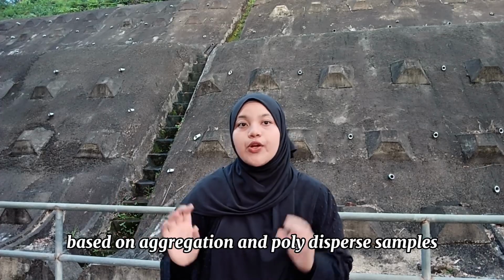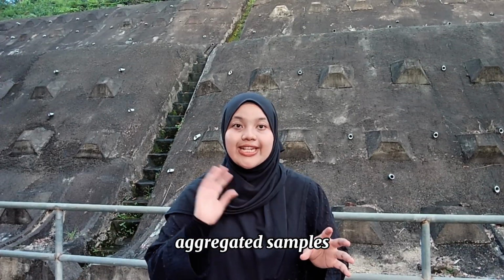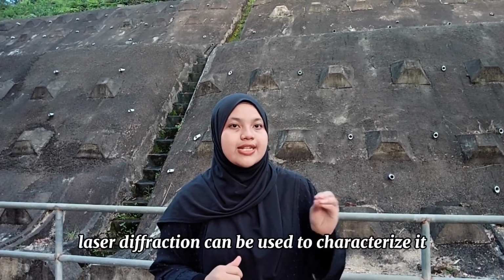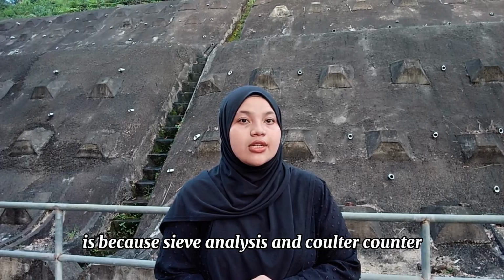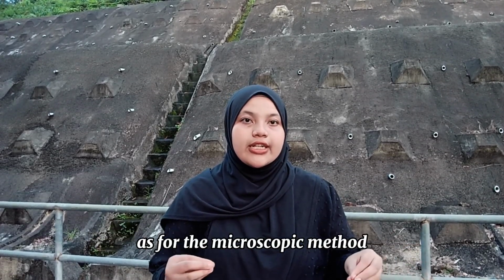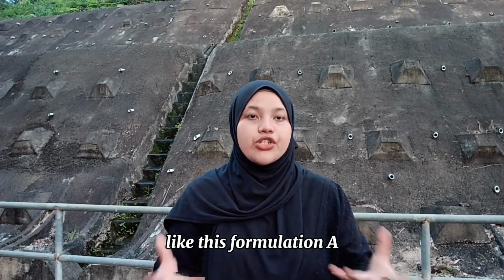Based on aggregation and polydispersed samples, it can be observed that laser diffraction could not characterize aggregated samples because it will not reflect the internal structure. As for polydispersed samples, laser diffraction can be used to characterize them. The reason we are not choosing the other three methods is because for sieve analysis and Coulter counter, the mechanism involved in both methods will actually damage the fragile proteins. As for the microscopy method, it is not suitable for a complex powder like this formulation A.